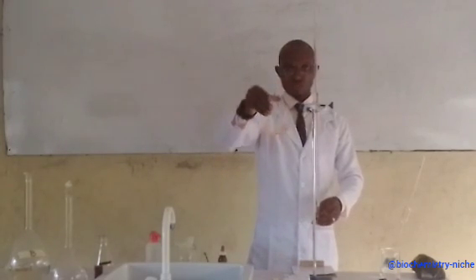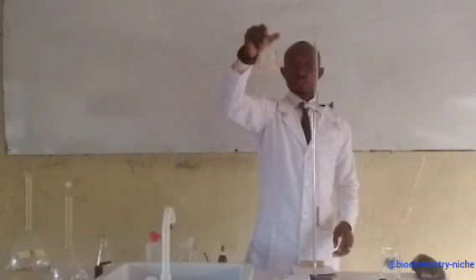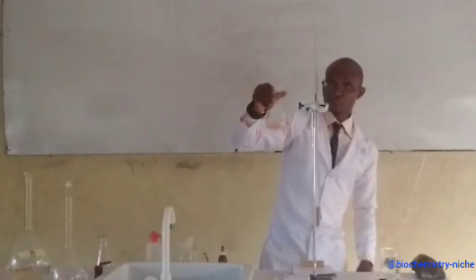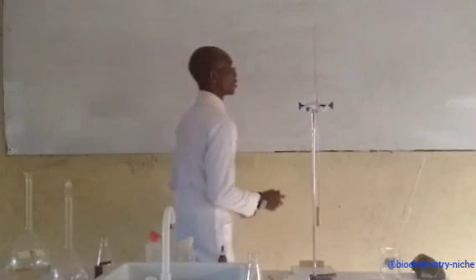So that is what I'll be doing now, and I'll be trying to watch out for a change in color. I'm already seeing slight changes in the color. I'm still seeing, yes, that started changing, but I'm still seeing some traces of golden yellow in it. So let me add a little bit of the acid into it. Okay, this is what I have now. So at this point, my reading right now is 19.9.